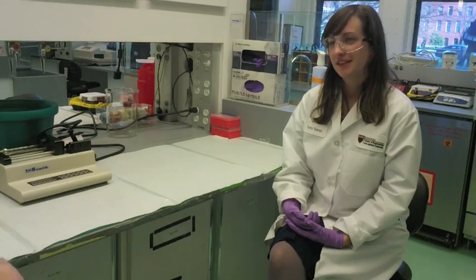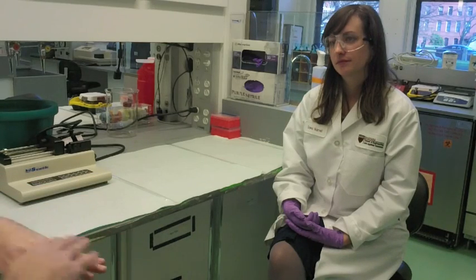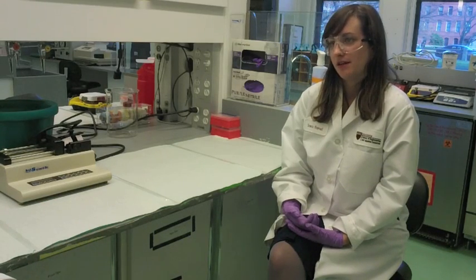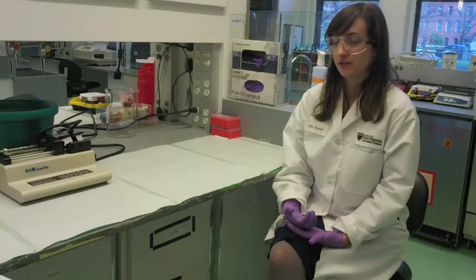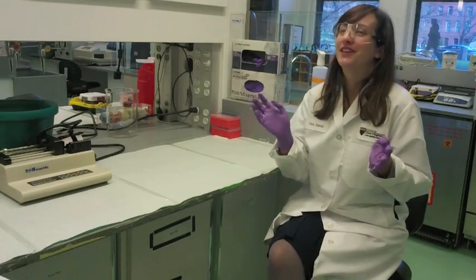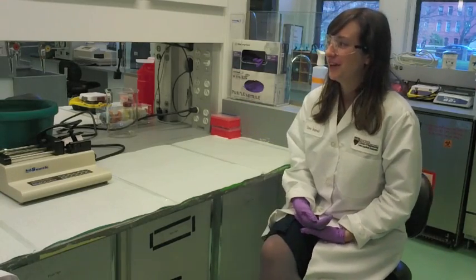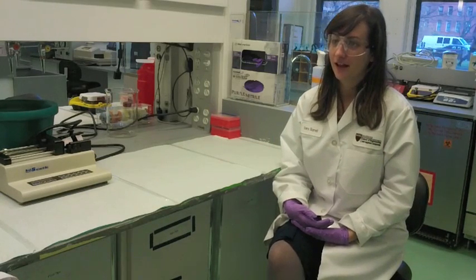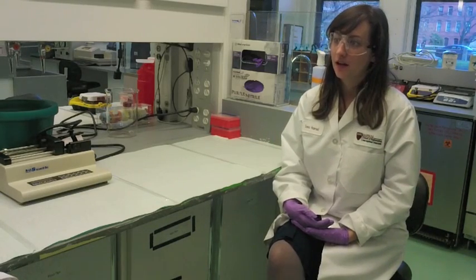Would it be useful if you had a device that would, sort of like a chemostat, keep the cells at a constant density, and then you could pull them out and use them whenever you wanted? Would that be helpful? That would probably, I think that'd be crazy. I think it'd be so helpful that labs would take it on if it was an accessible product. I think labs would definitely take that on.